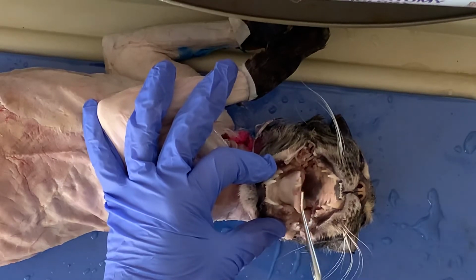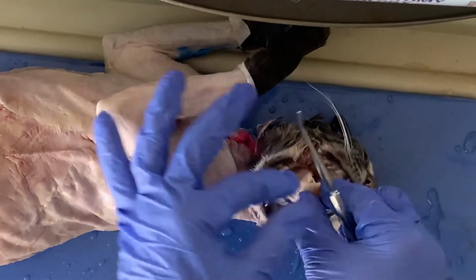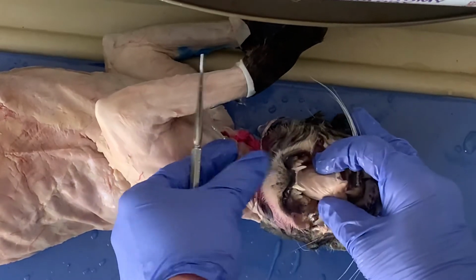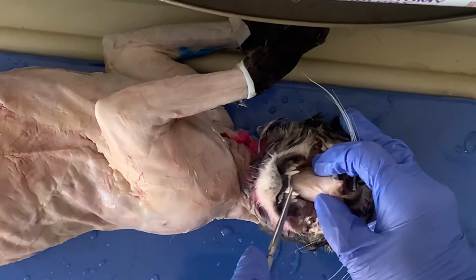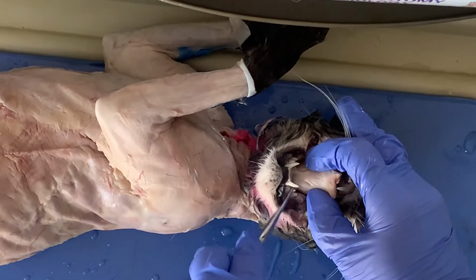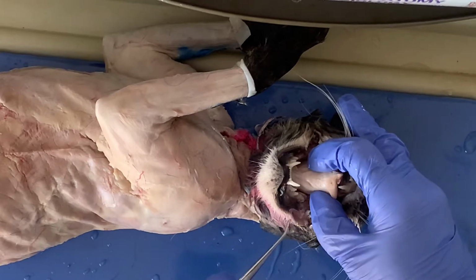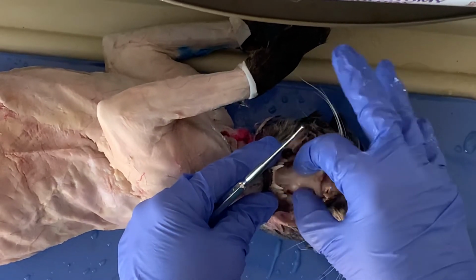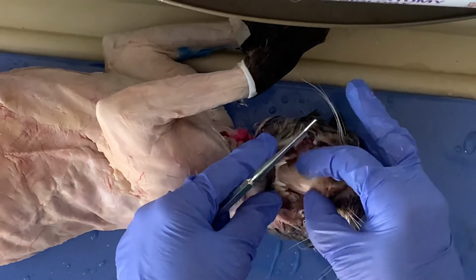The tongue, obviously, remember there's this cool little flap of skin that we have under our tongue too here called the frenulum. And this is what connects the tongue to the base of the jawbone here, your mandible there. So your tongue doesn't fall out, or so people don't swallow their tongue.